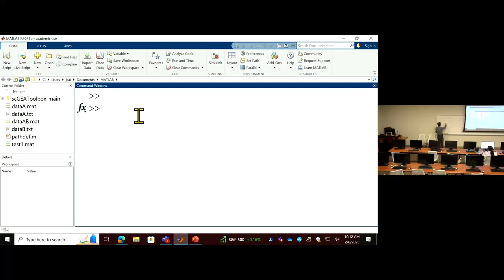The first variable is big X. This is a matrix containing the single cell data, which is a count for each cell and each gene. Let's say we have a small X, okay? We are going to play with a small toy. And then another variable is G, right?